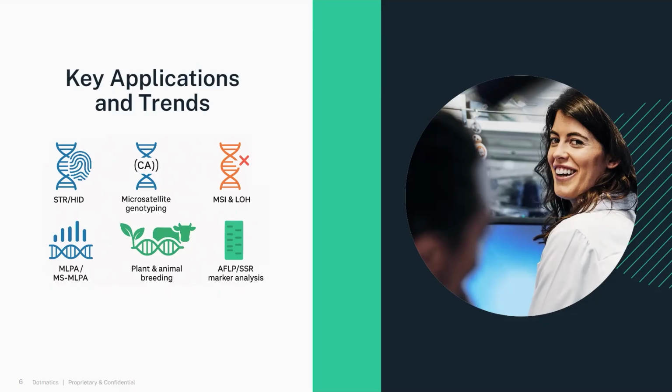Chimerism testing post-bone marrow transplant takes advantage of human STRs and is the most commonly used screening and monitoring process to track chimerism. Human identity STRs provide a cost-effective way to monitor stable chimerisms and for early detection of GVHD, or graft versus host disease.